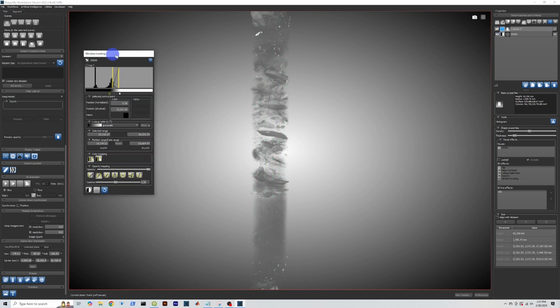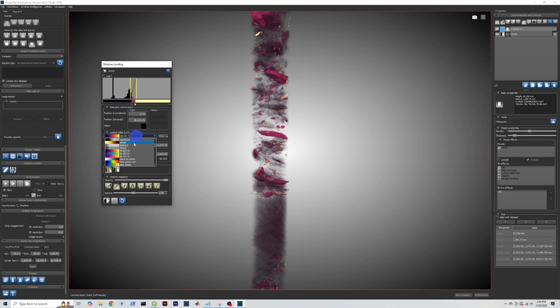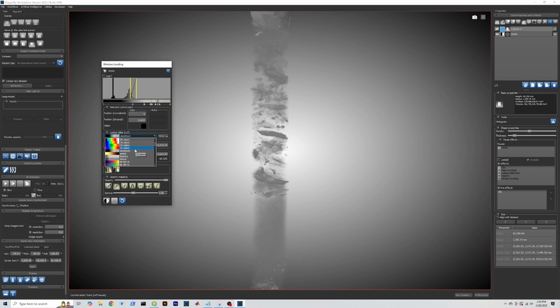Okay, so now if you wanted to export some three-dimensional either screenshot or movie from this feature, I would say the first thing that you should do is get the visualization that you want. Like maybe you don't want this, you want this instead. And let's opacity map this here and here. And now let's actually select that again. Can we do that? Let's see. Well, probably a way to change this color map, but I'm not going to play with it for the time being.